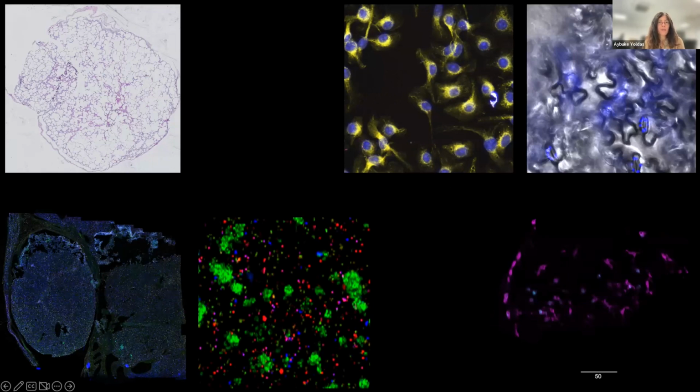what is the organism that is being imaged here, under what conditions, how the specimen has been obtained, and so on, which are all the necessary information to make sense of those images and to potentially reuse them or reproduce them, which are the basic principles of science.